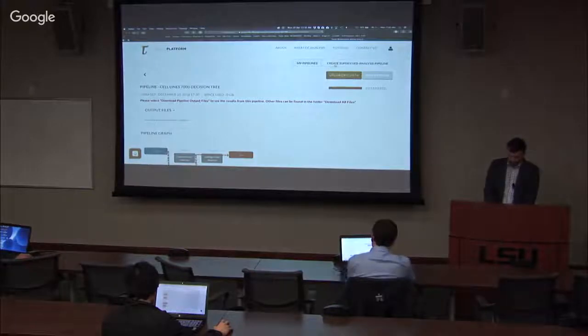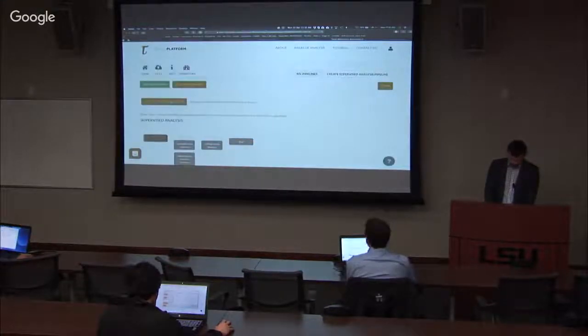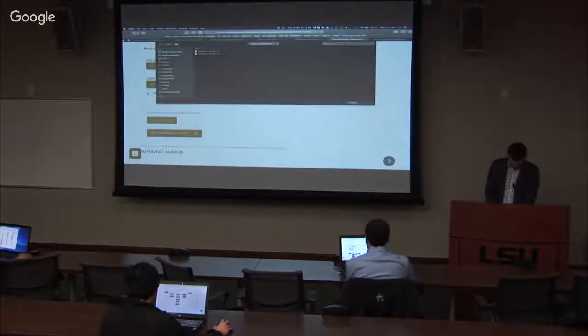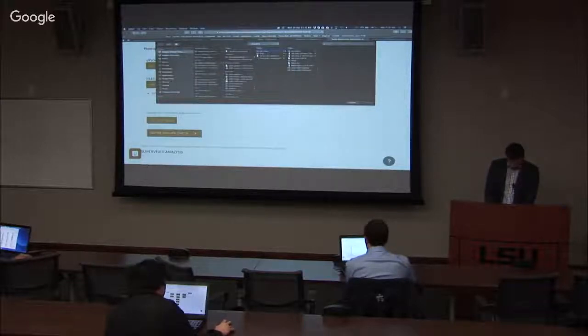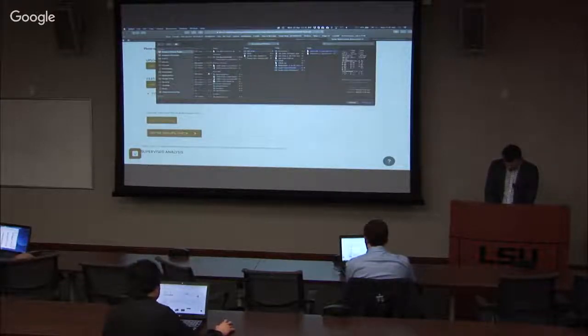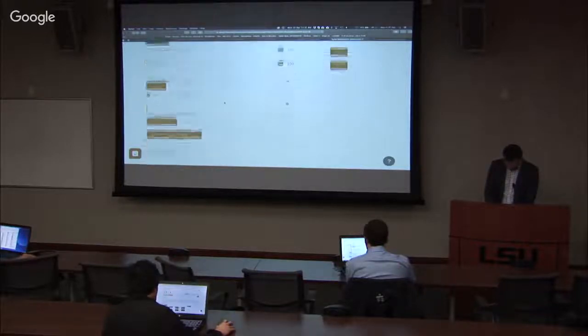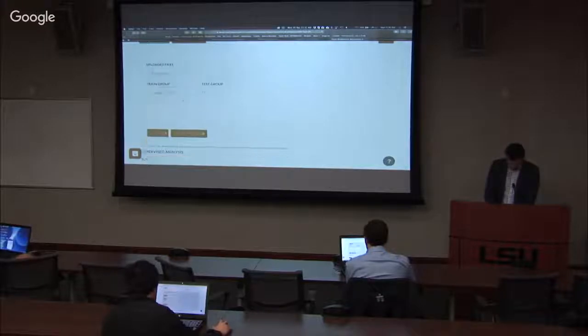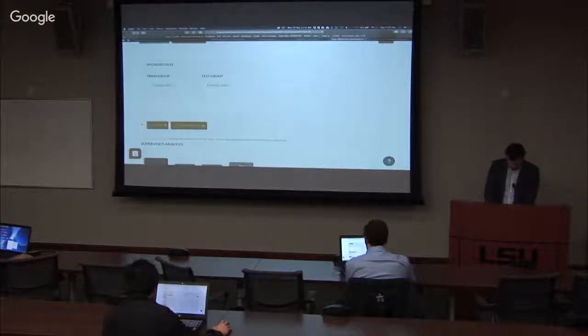And while we're here, let's go ahead and do the same thing for the 15 genes. So instead of 7,000 genes, you have another folder here that's called 15 genes. And again, both files. We can do the train here, test here.